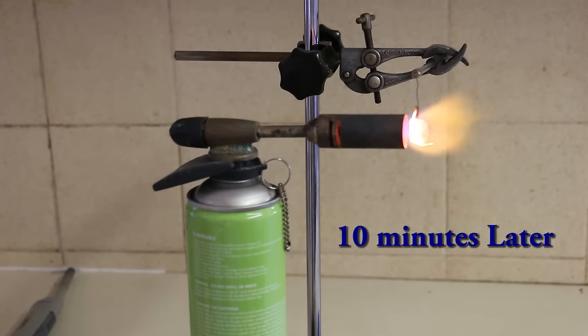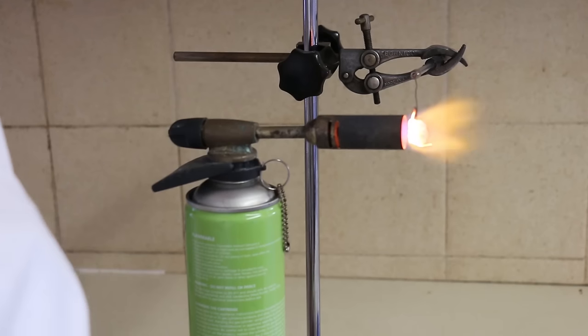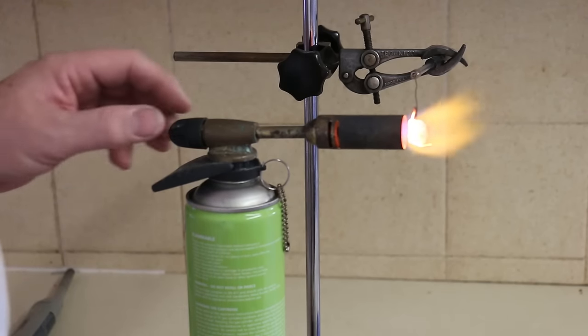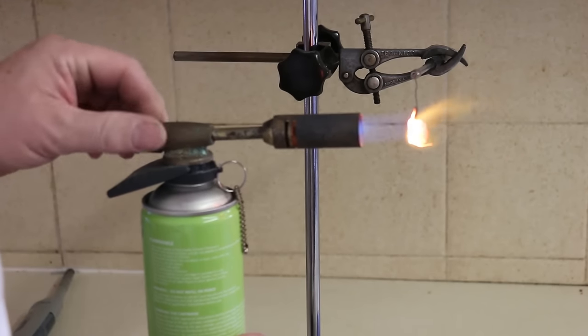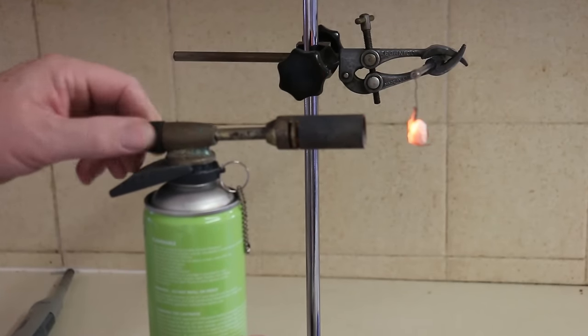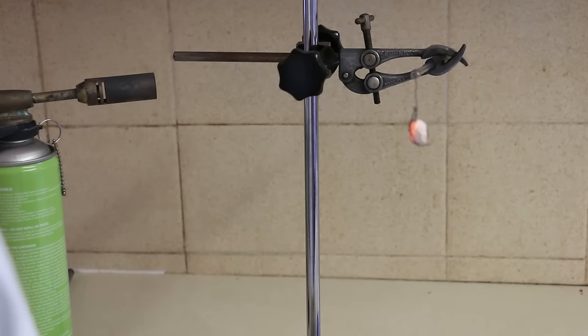Now that the rock has gone completely white and it's glowing red hot from within, we can now turn off the flame and allow the piece of calcium oxide to cool. And then what we'll do is weigh it again so we can compare it with its former weight.